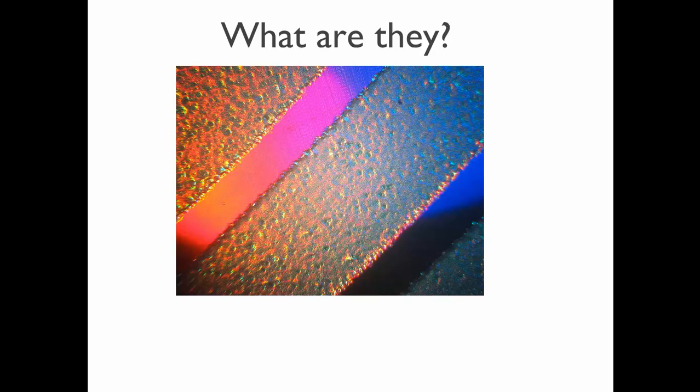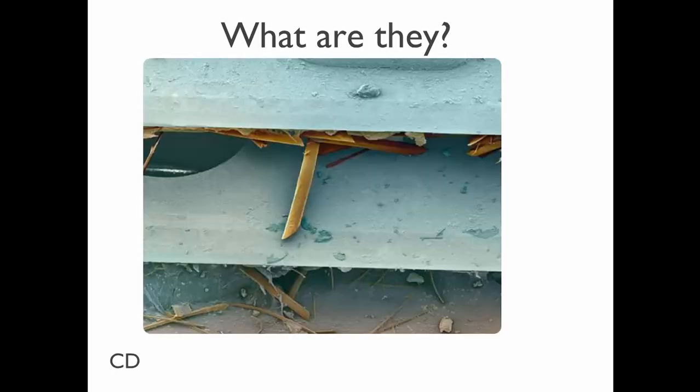Ali, what do you think it is? I think it's a wristband under an arm. No? A fork? No. Water? It looks like someone is behind bars. So this is actually a CD or a DVD. These are the rings around the outside of the DVD that your DVD player reads data from.